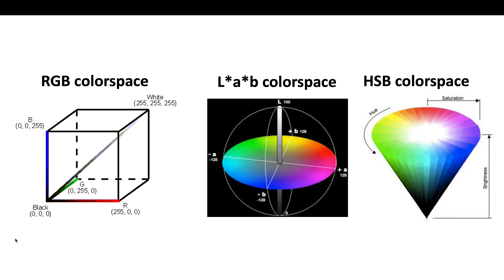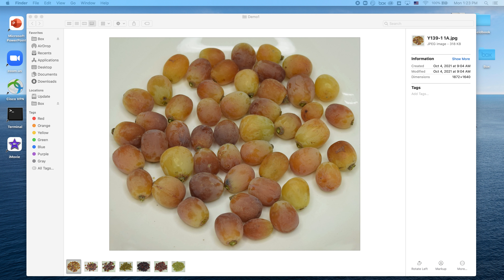Beyond the RGB color space, there are also other ways to define color in images, such as the LAB color space or the HSB color space. Similarly to RGB, you have three channels coming together to mathematically define the color in each pixel. In this process I'm going to share today, we'll analyze color in our grape images using these multiple color spaces.